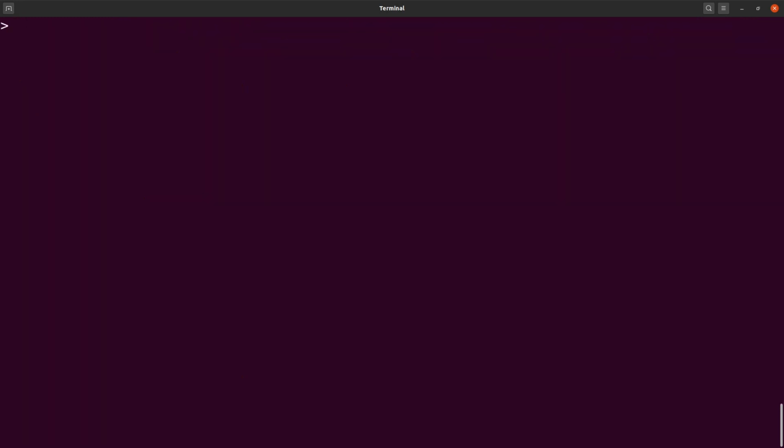So let's quit R. We say q, then give our parentheses here and hit the enter button. We are being asked to save the workspace image, but I don't need to do that. So I'll say N and then exit the R environment. Now we have all the packages we need installed, so we are ready to start the analysis. Let's clear the screen and continue.